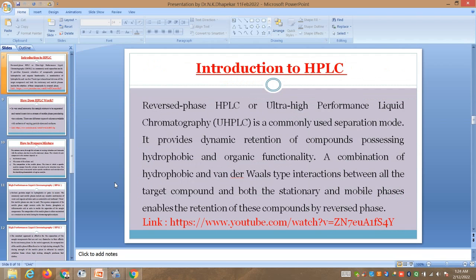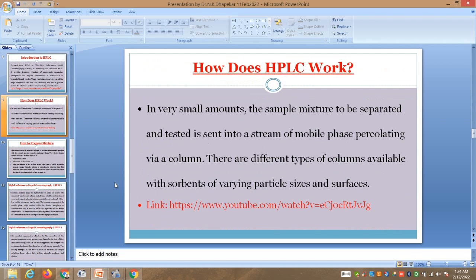So the next application of this HPLC in civil engineering industries is cement paste. In cement paste, there are various types of cements, M43, M53, then white cement, and hundreds of types of cements. And the molecule of interest in cement is generally calcium silicate or calcium silicate hydrates. So these compounds can be quantified in a very easy way through HPLC.